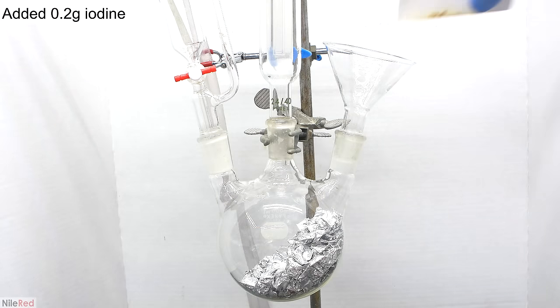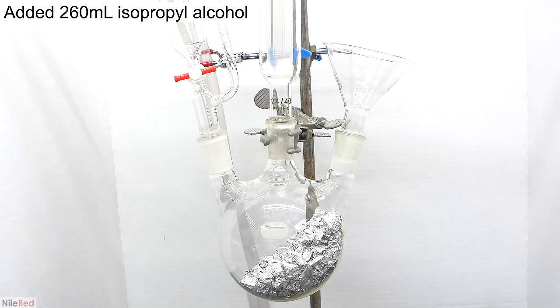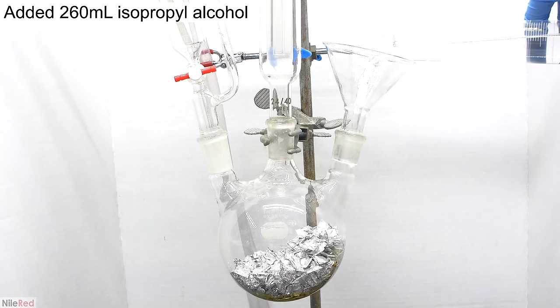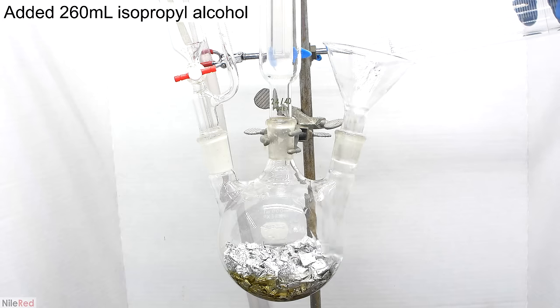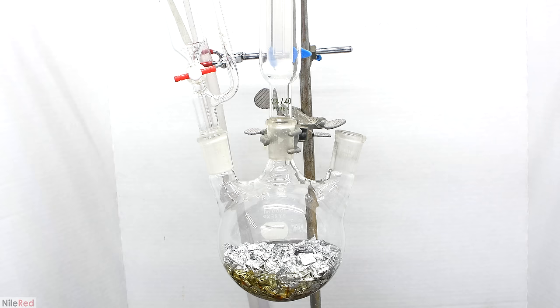After all the aluminum foil was added, I dumped in about 0.2 grams of iodine. Then on top of everything, I added about 260 milliliters of dry isopropyl alcohol. As the isopropyl alcohol is added, it takes on a slight yellow color as it dissolves some of the iodine. At this point, we don't need the funnel anymore, so I replaced it with a stopper.